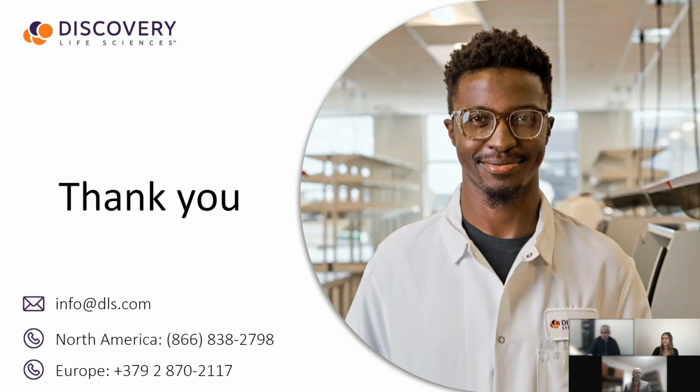It is possible to integrate it on the Janus under a modular approach, but this is the kind of question that requires a more in-depth evaluation, and I would encourage you to reach out to us so that we can have a discussion and really understand what the needs are for the integration, from number of touch points, to the different capability of the liquid handling system to be integrated with the R230.